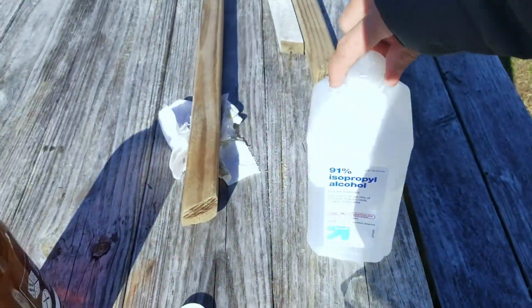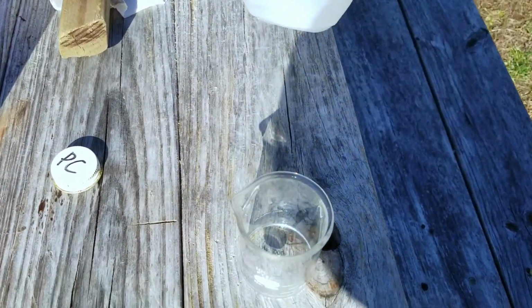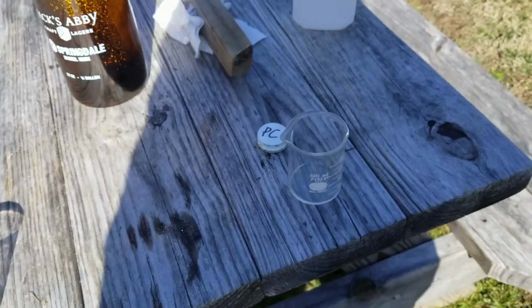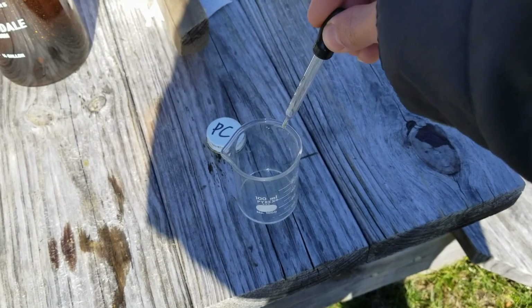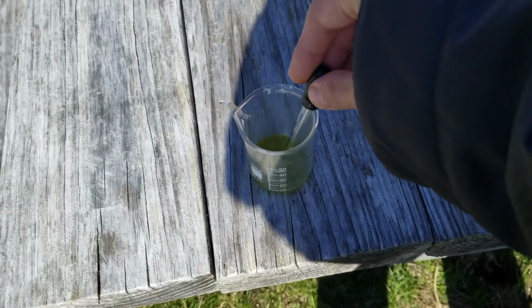But what I'm gonna do now is I'm gonna get a little bit of isopropanol in here. Waste isopropanol, because we should be using the good stuff to fight corona. Get a bit in here. And it may be able to set it on fire. Yo, did you see that? It bubbled. That was actually so cool. Let's get a bit more.